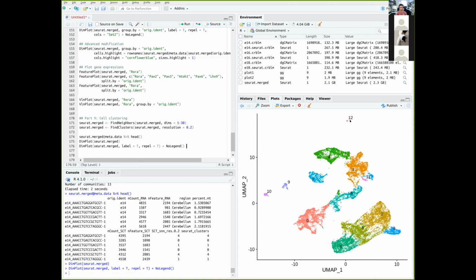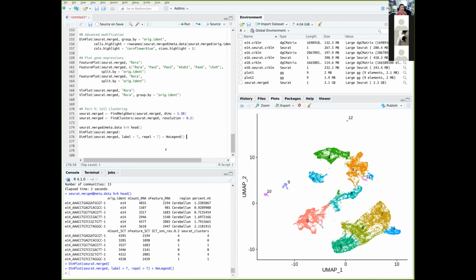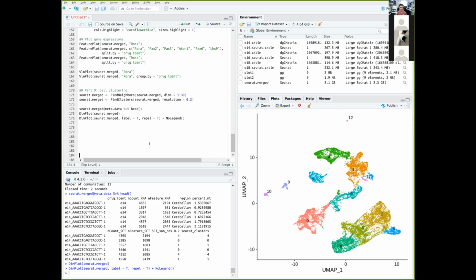And this is very pretty just to begin with. Even though your data looks less optimal, when you see colors of a spectrum segregated from each other in a UMAP plot, it gives this sort of euphoria that you're doing something correct, and drives you to finish out the whole analysis. That's at least for me. This looks very, very nice, very pretty.